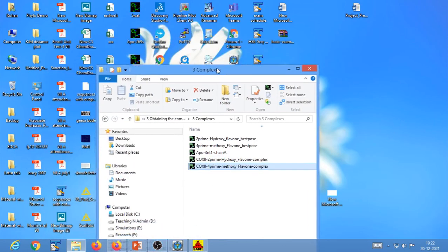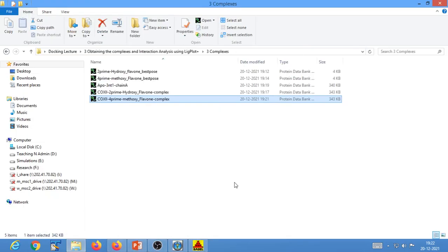Okay, so in this way you generate all the complexes. Now let us start performing the interaction analysis. Interaction analysis can be done. Why do we do such interaction analysis?